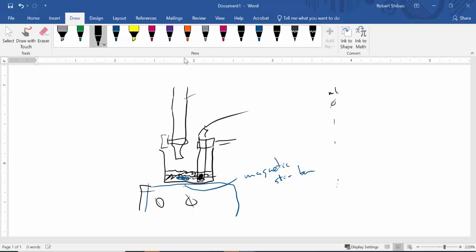Each time you add, you have to wait until the pH stabilizes, which is painful. Okay? Takes time. But it's easy, I think. And along the way, you want to visualize the curve. You want to make sure you got enough data to properly sketch out the entire curve in your mind. Okay. All right. Any questions on this? Just collecting data. All right. That's all I'm going to say then.